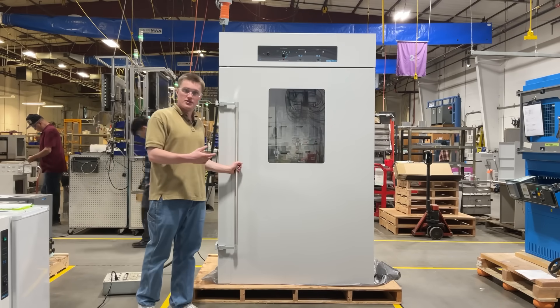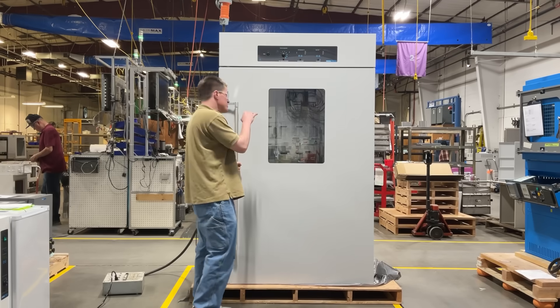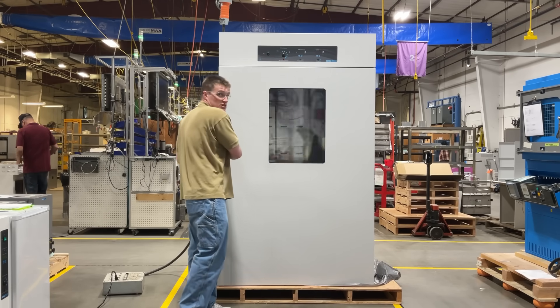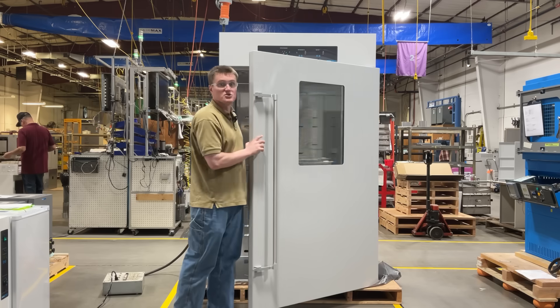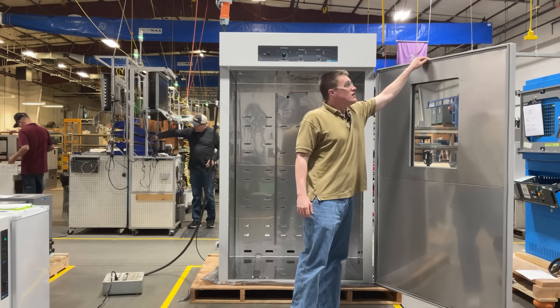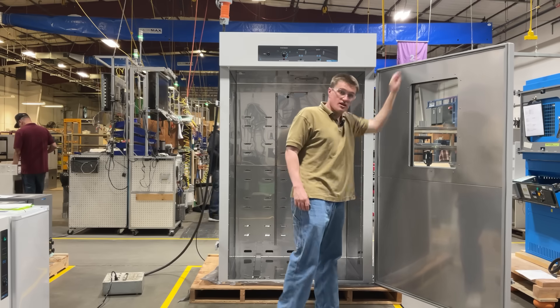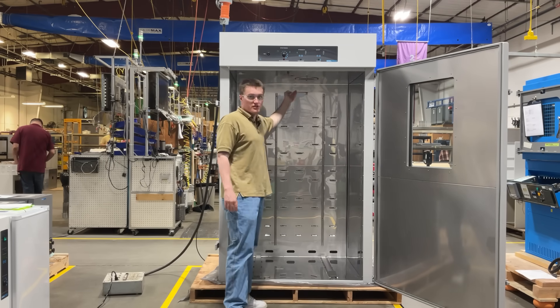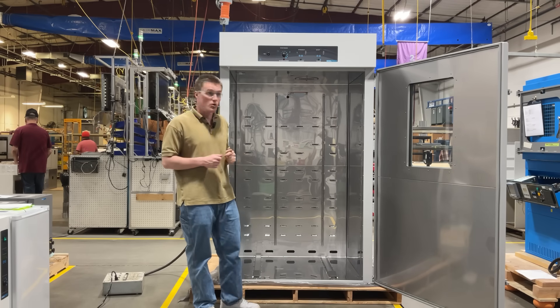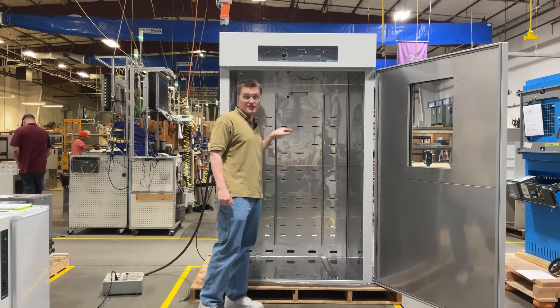Now let's take a look inside the unit. The first thing that you will notice is a large tempered glass viewing window. This allows you to look inside and monitor samples without actually opening up your unit. The sturdy door construction, coupled with the door gasket and powerful air circulation, provide excellent temperature stability, uniformity, and control to each of the six provided shelves.